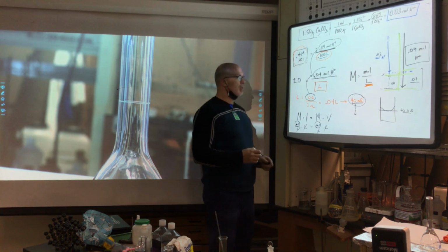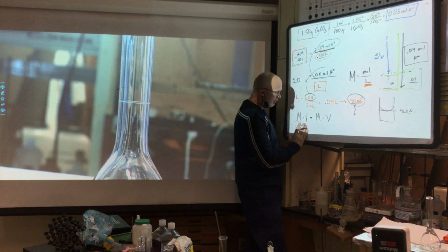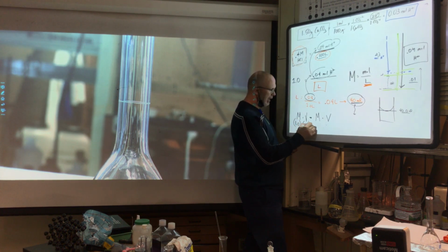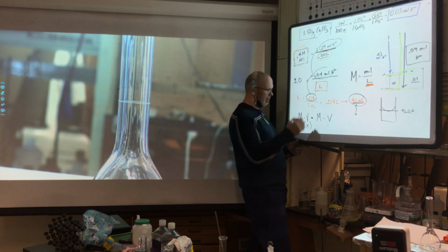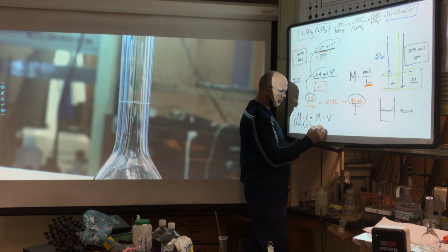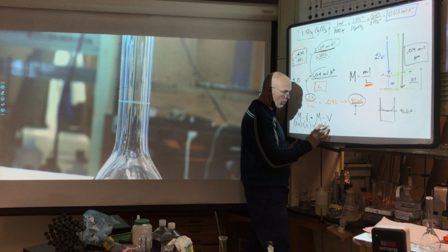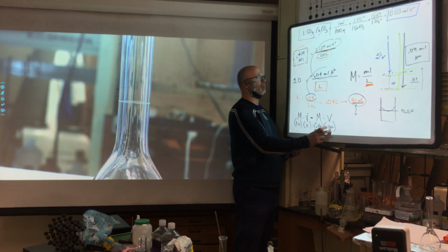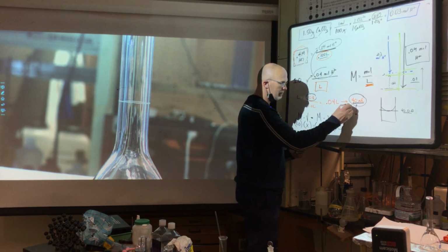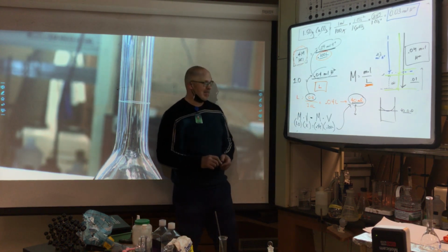Same idea. So how do I do this? Very simple. Take your stock solution, which was 1 molar. We're going to solve for the volume of this we need. Here's our target. The target that we're looking for is a 0.4 molar solution, and we want to make 100 milliliters, or 0.100 liters. Molarity times liters. You multiply. We already did that. So this times this divided by 1, guess what you're going to get? 40 milliliters. We just kind of did it.